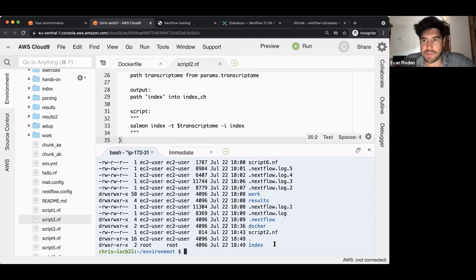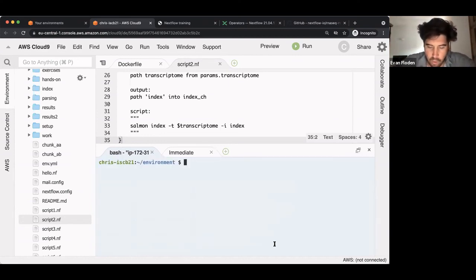So if you think about that, that's kind of why people sort of move towards Singularity, because it doesn't have this daemon process which is running as root to launch. Everything else is the same though, and I will show you in a moment that we can use our Docker files in many locations. All of this was a very long-winded way for me to say, don't do this.